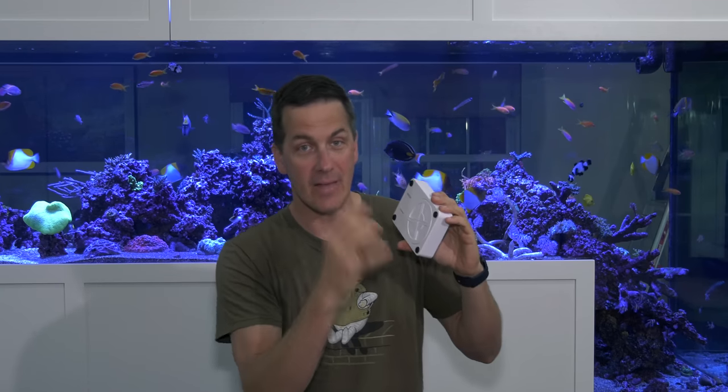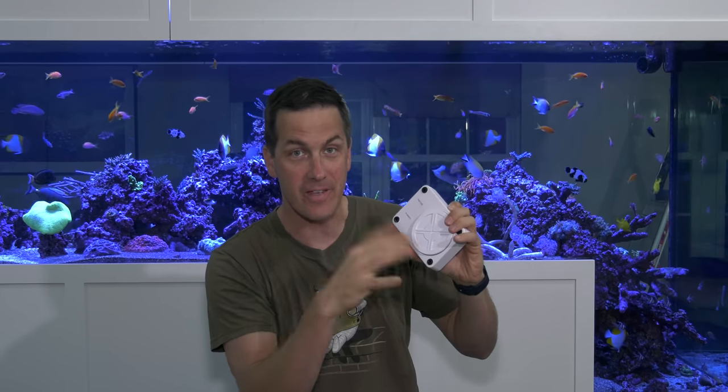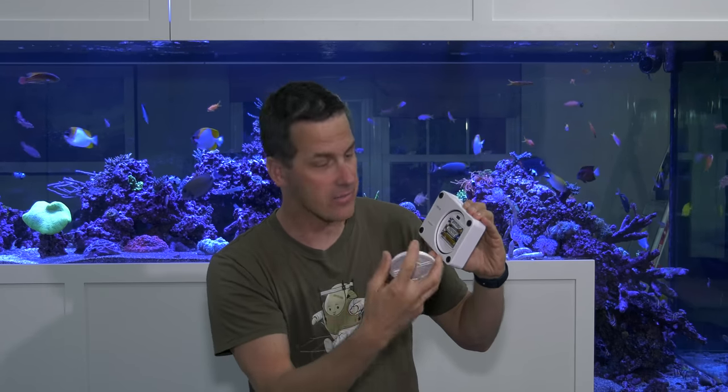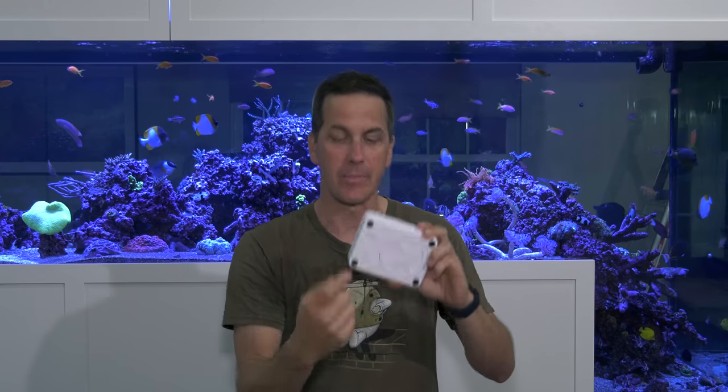The first thing that jumped out to me about this thing was the battery. On other checkers, you have to undo a little screw on the bottom, take off the bottom cover, hope that you don't lose that screw, and then put in the battery. With this thing — I love this — all you got to do is unscrew this back panel with your fingers, no tools needed. It pops right off. You have access to three AA batteries, and it's got an o-ring in there, so this thing has to be at least somewhat water resistant. Easy to swap the batteries — nothing's worse than being out in the field and having your Hanna checker die and losing that little screw.